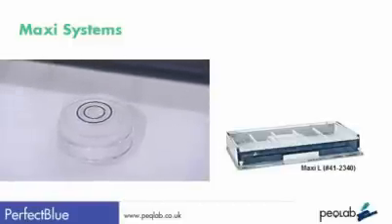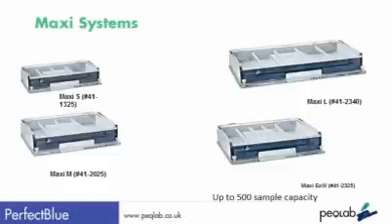The Maxi systems are available in small, medium and large size, plus extra-wide systems for very high throughput separations. In conjunction with micro-titer combs, the Maxi extra-wide tank can accommodate up to 500 samples.